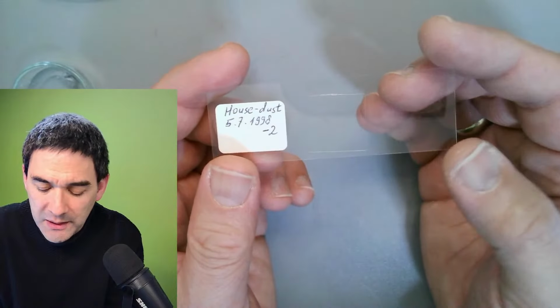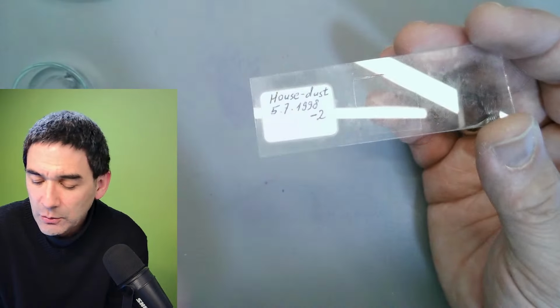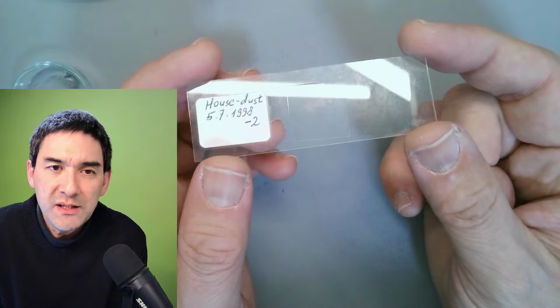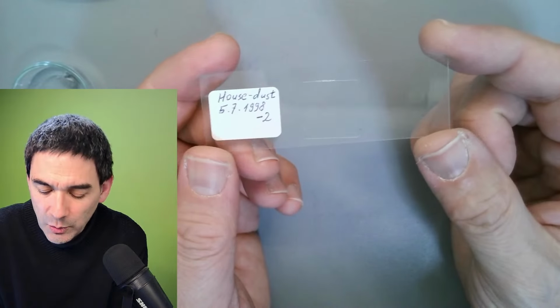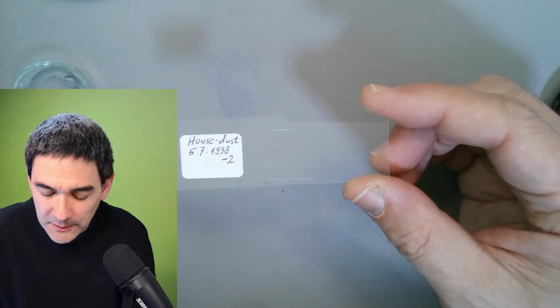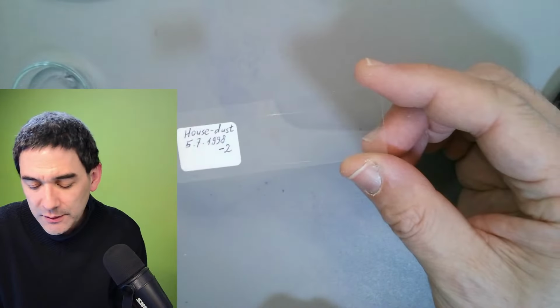So this was at the beginnings of microscopy. I was just practicing making slides, and I collected whatever dust samples and stuff that was easy to make. At that time, the mounting medium that I used was known as Euparal, which is not healthy because it contains an organic solvent, but it was a very fast drying one and a very stable one. So I wanted to share this with you as well.